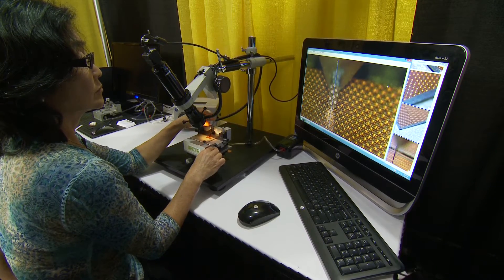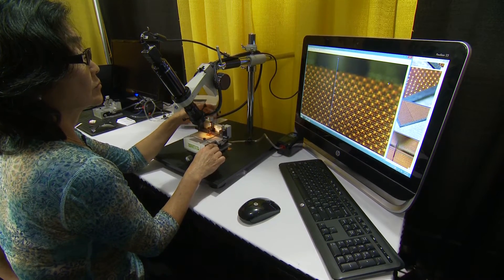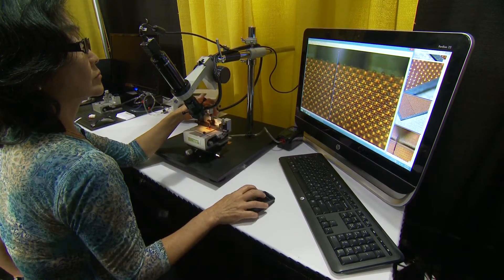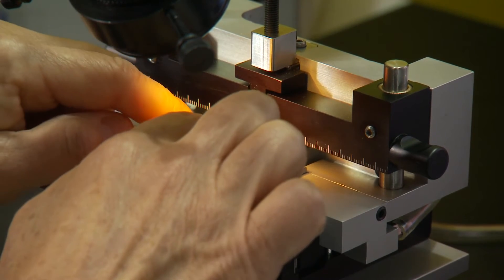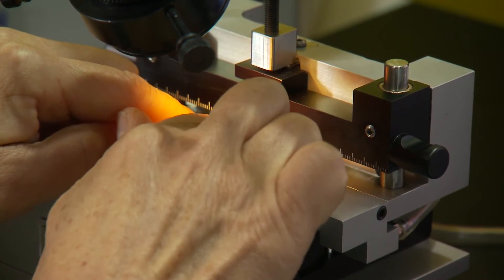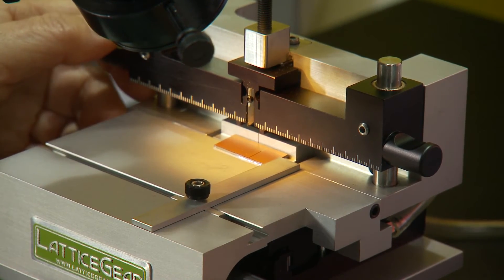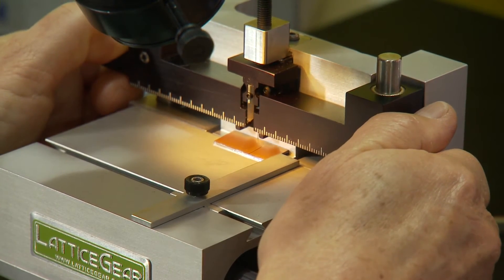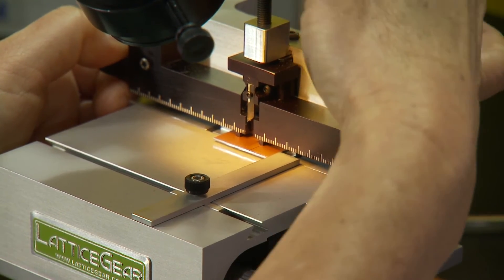It is able to adjust the indentation depth and thereby accept any sample, thin or thick. Once the indentation is complete, we can move the sample to cleaving position. Cleaving position will position the indentation over a pin and then, using the cleaving bar, moving the cleaving pins on the surface of the sample, pressing equally on both sides of the indentation, and initiating a cleave from the indentation on.